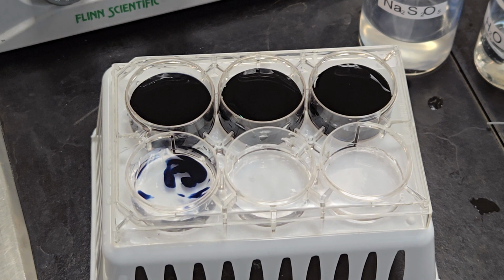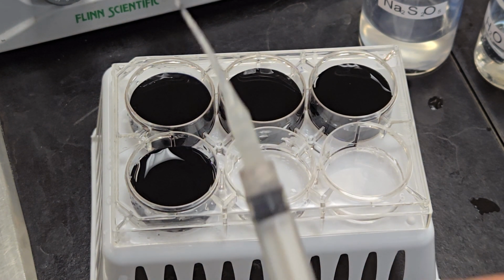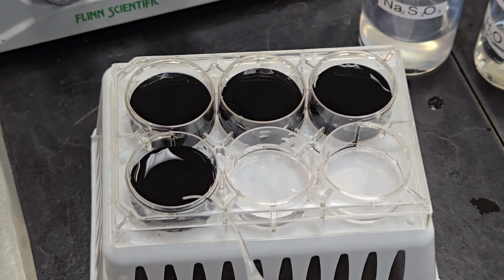There we go. If you have been marking your time from the second the reaction starts to happen, that is absolutely fine, as long as you did it the same way every time. If you've been marking the time from when the reaction is complete and the whole thing has changed color, that's fine as well, as long as you've done the same thing every time. Consistency is the only issue in that case.